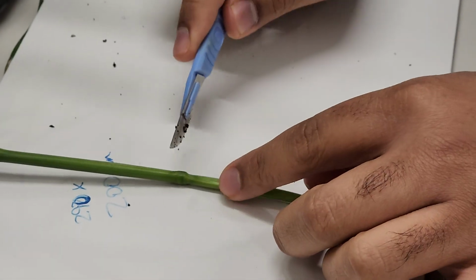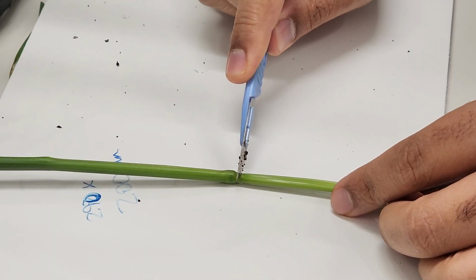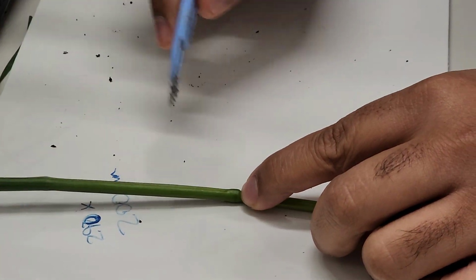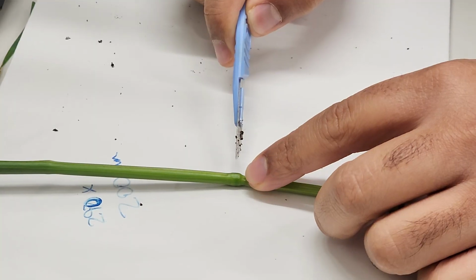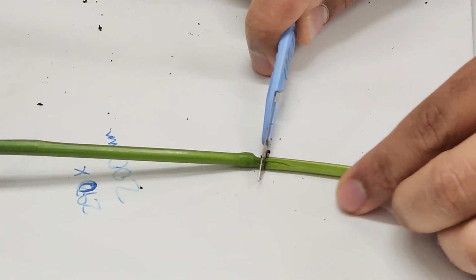I just want to prove my concept. If we get this wrong, we just get a new one. So I suppose that the meristem for this wheat should start from here, because this is the node. Node is where the meristematic region is. So we cut there.